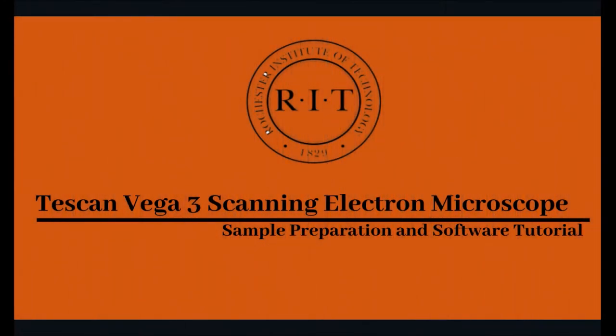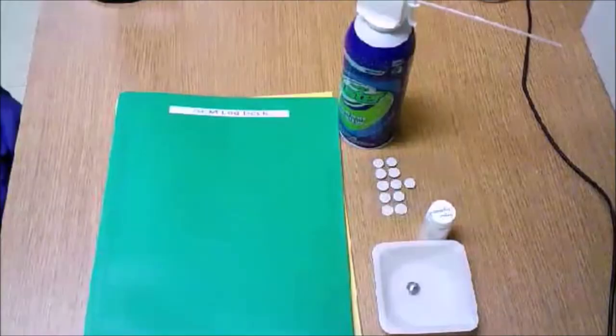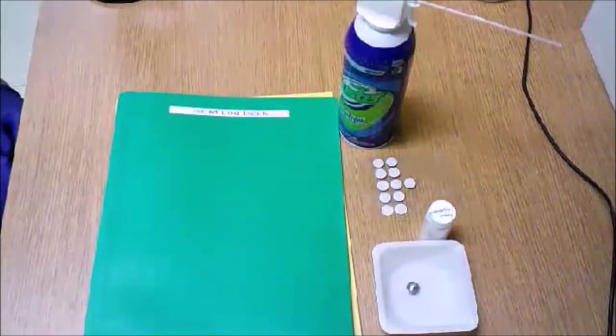In this video, we'll be discussing the operation and sample preparation for the TESCAN Vega 3 scanning electron microscope located in the School of Chemistry and Material Science. My name is Aubrey Holland and I work in the School of Chemistry and Material Science Instrumentation Lab at Rochester Institute of Technology.